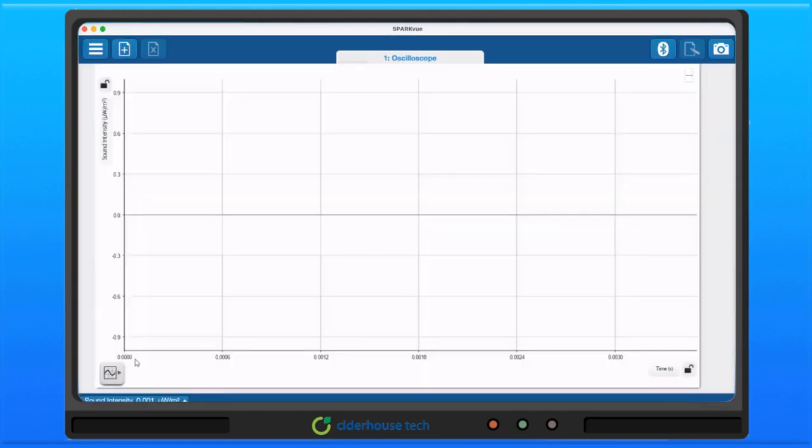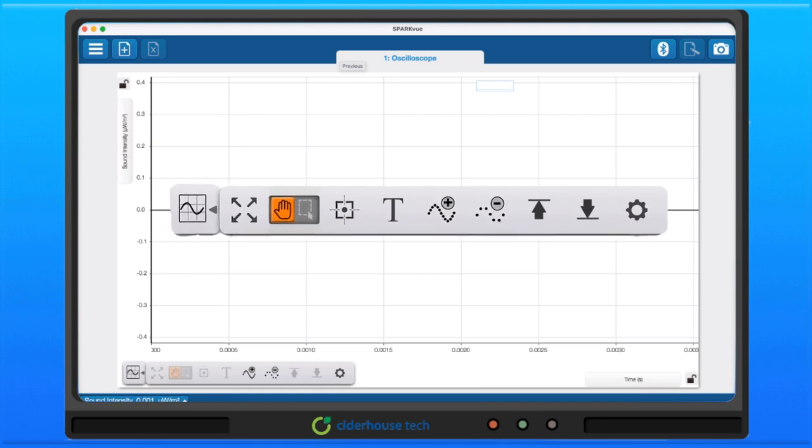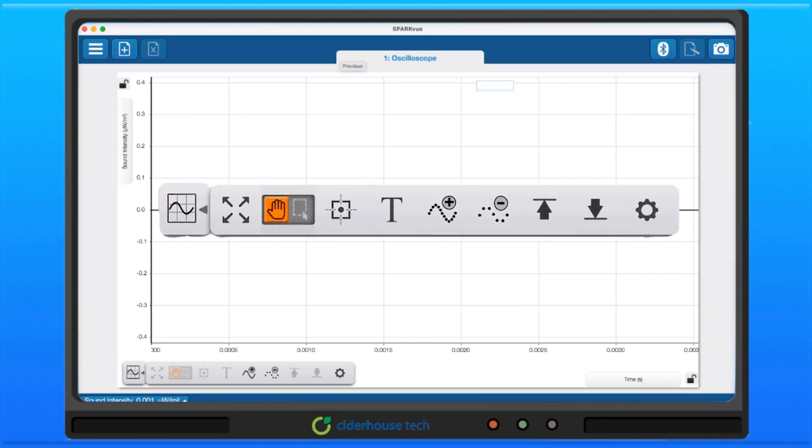I can tell that I'm in the scope mode because the icon at the lower left-hand side is going to be that of the oscilloscope display. Let us examine the toolbar. Scale to fit. Toggle move or select mode. Add coordinates tool. Add annotation. Increase data points. Reduce data points. Positive trigger. Negative trigger. Settings.